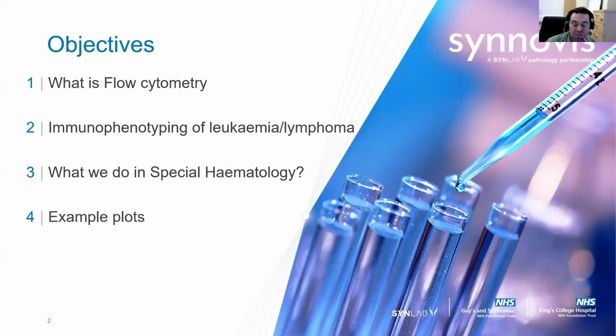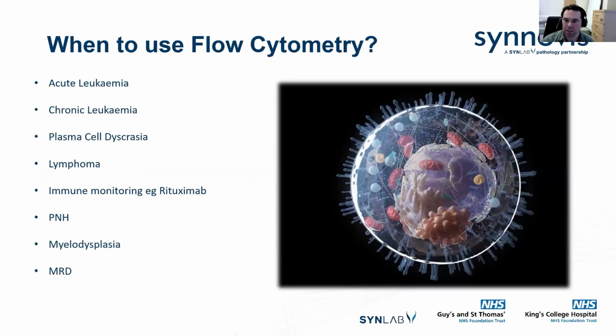Yeah, so this is just a brief agenda. What is flow cytometry? We'll talk about the immunophenotyping of leukemia and lymphoma, what we do in specialty hematology, and then at the end of the talk, I will go through some example plots from patient cases.